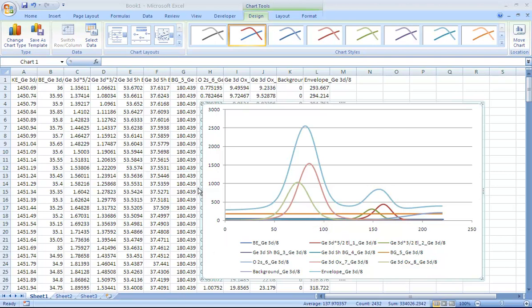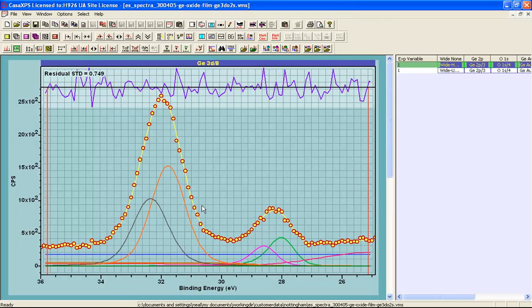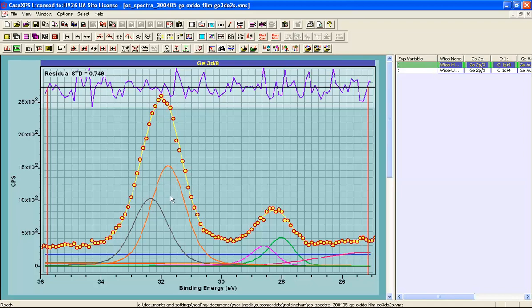The information that has been exported to Excel is linked to the way the data are displayed within CASXPS. The plot in Excel was very similar to this plot. So if I change the way these are displayed in CASXPS and then export the peak model, we will obtain a different set of information about this peak model.